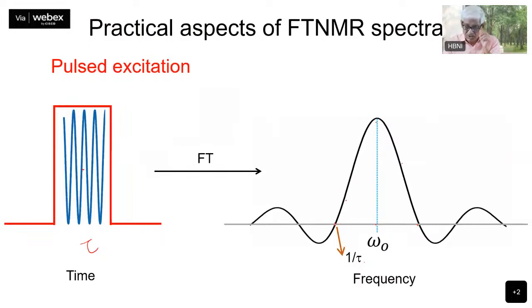However, all these 200 kilohertz are not useful because they have different amplitudes. If you want uniform excitation of your frequency range, let us say you have a frequency range of about 10 kilohertz. Then you have 5 kilohertz on this side and 5 kilohertz on this side that you can excite. You can choose a small area here, about 5 kilohertz compared to the 100 kilohertz, and that is not a problem.